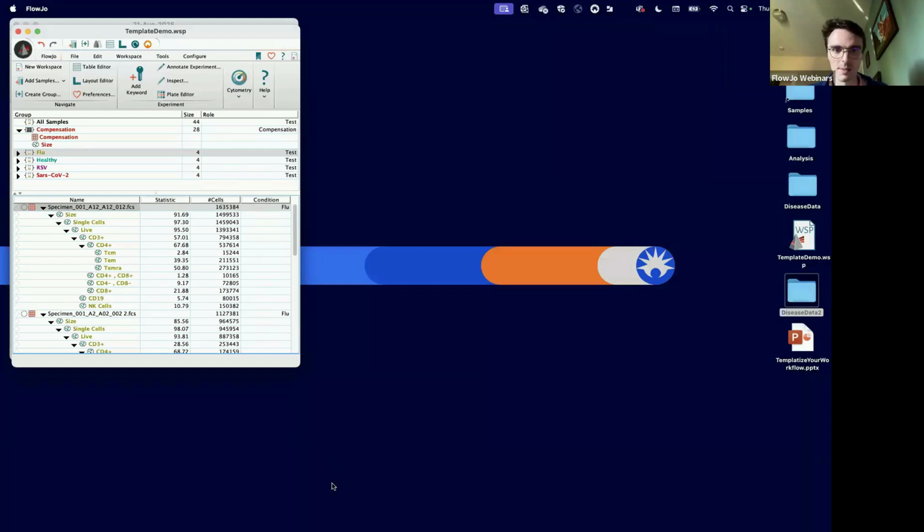Before I get started, let me see, somebody said something in the chat. Somebody asked about transferring templates from v10 to v11. The first version of version 11 that's out right now is a pretty basic initial release. So there's no templates in version 11 yet. So no, I guess you can't transfer templates into version 11 at this time. I think they're planning on adding that feature in the future, but it's not in the first release. We'll have to wait and see, maybe a year from now or something, we'll have a more updated version of 11.